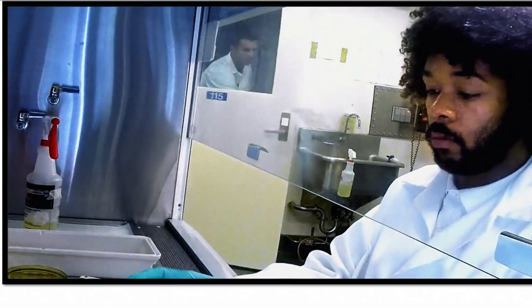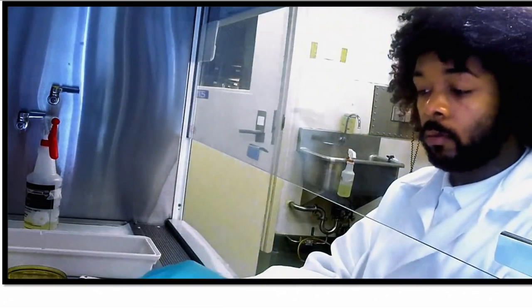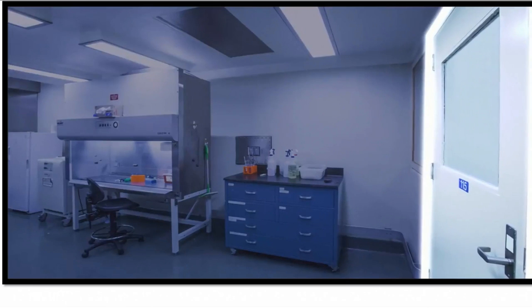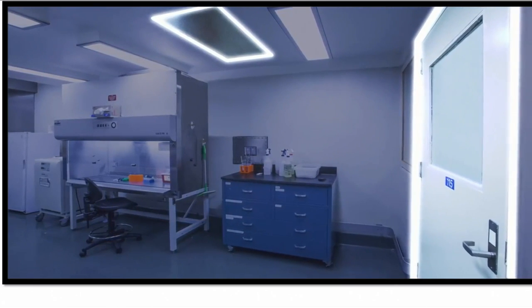Too much foot traffic can cause problems as well, and should be kept at a minimum. If pedestrians are unavoidable, keep people at least 1 meter from your BSC. And remember to check nearby doors or supply vents to determine if they disrupt the cabinet's airflow.